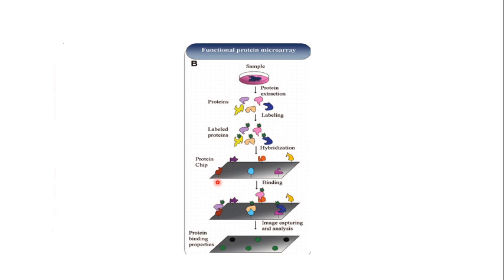Now, on your protein chip, you have immobilized the full-length proteins whose interactions you are interested in.